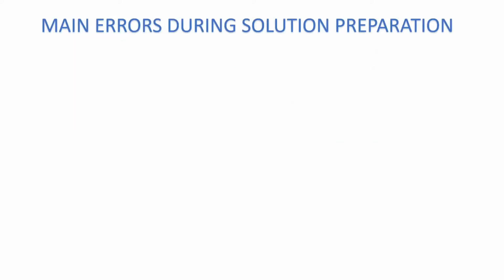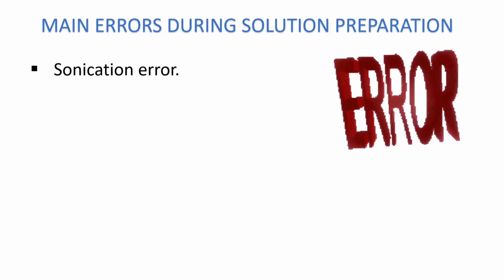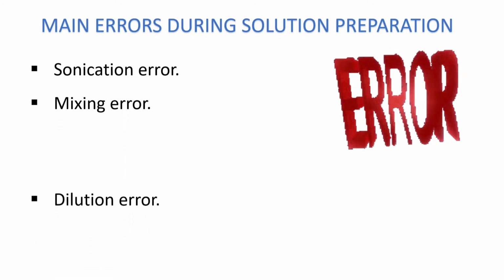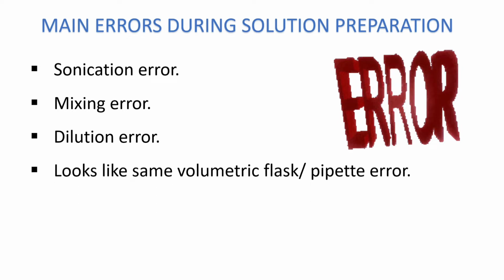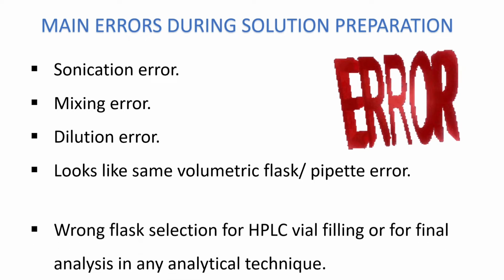So what are the main errors during solution preparation? Sonication error, mixing error, dilution error, and the same volumetric flask and pipette errors are part of solution preparation error.